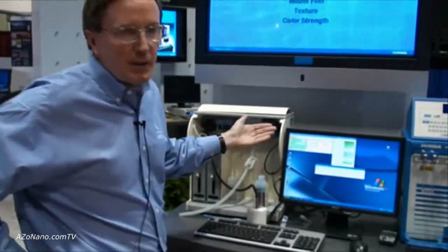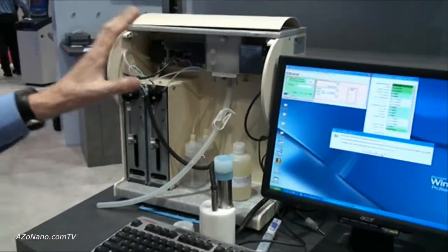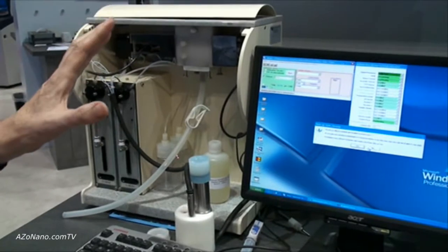What we have in front of us here is a particle characterization tool specialized in some ways but very broad-based in others in terms of the applications you can use it for.